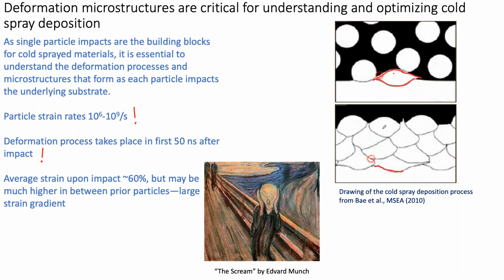So that would be, say, on the average, if each one of these is, say, 20 microns going this way, well, that'd be about 80 microns. And if it's less than that, you'll start to have problems with coverage, right? It becomes a statistics problem at that point. So I would say rule of thumb, trying to dip below about 100, 150 microns is going to start to cause property issues, but you should be able to get down to 100, 150 microns fairly easily.